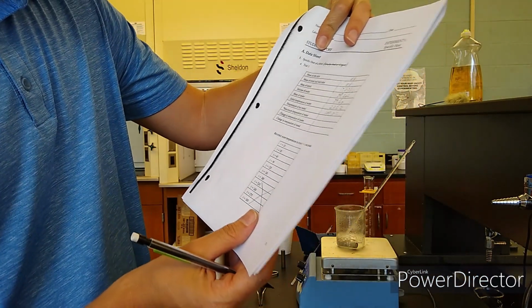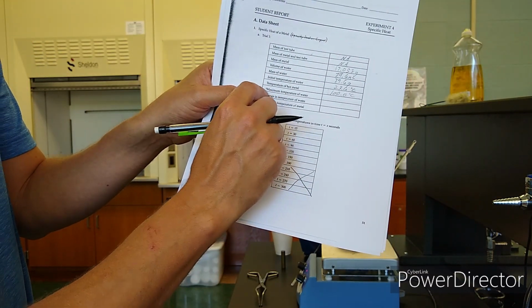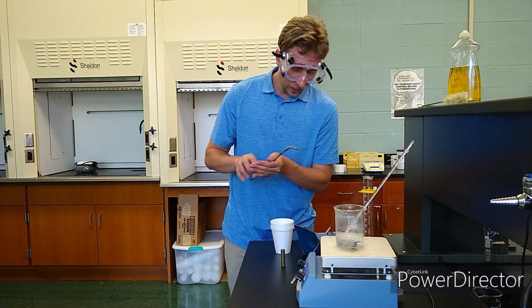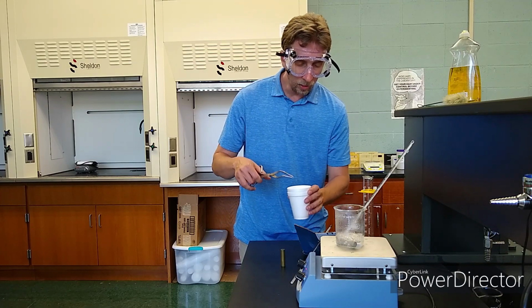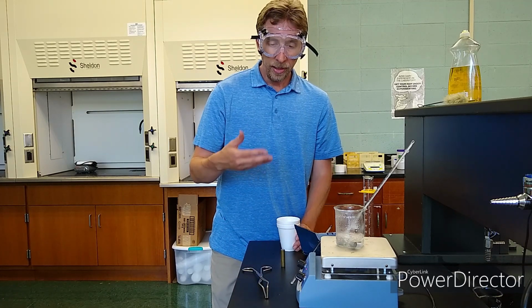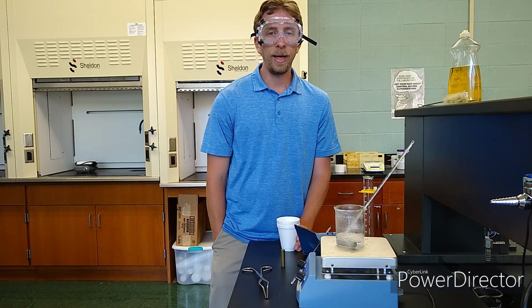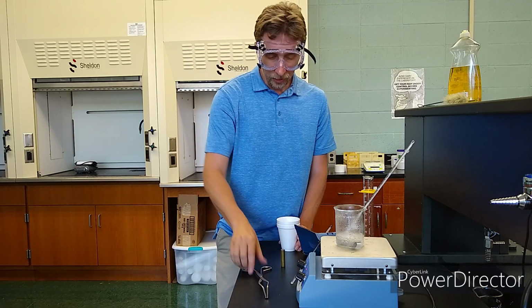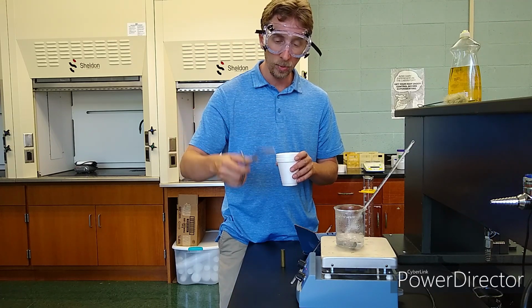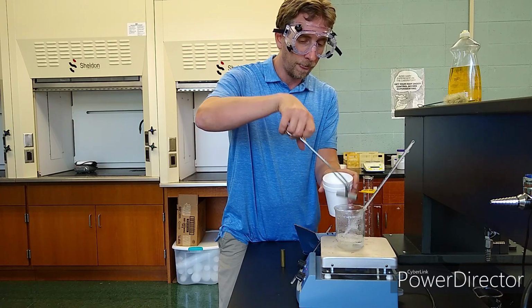All right. Well, whenever it says right here, the maximum temperature of water that is inside the calorimeter after I make the transfer into the calorimeter. So this is the big critical step here, is transferring it in here, putting the lid on there smoothly, and then measuring the temperature change. Now, it says 15, 30, 60, 90, 120 seconds. And I don't have a separate timer. What do? I'm just going to measure it, and when the temperature stops rising, that's what we need, is that maximum temperature. Okay? Maybe I can count. That's too boring.